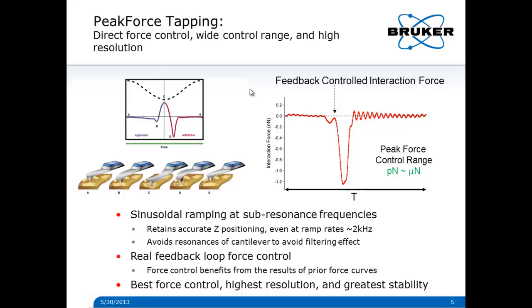The feedback benefits from prior curves and does not disrupt the sinusoidal piezo motion by attempting to reverse the ramp direction partway through the ramp, which, in combination with the other features of the mode, provides lower force during imaging, higher resolution, and new information about what the sample properties are. And then finally, this also makes it easier to use.